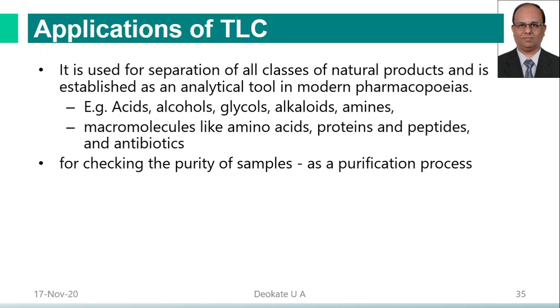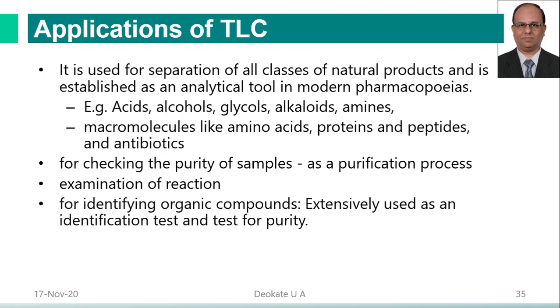It is used for checking the purity of samples, that is, as a purification process. It is also used for examination of reactions, how much the reaction is proceeding, which can be checked by using thin layer chromatography.